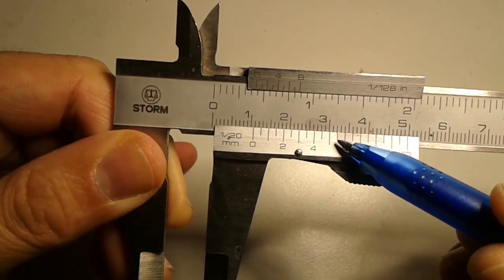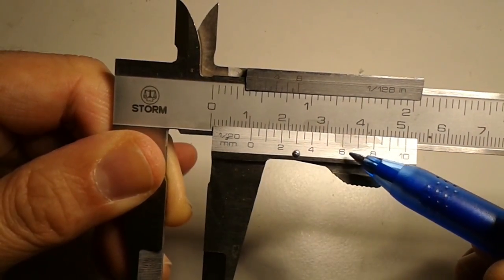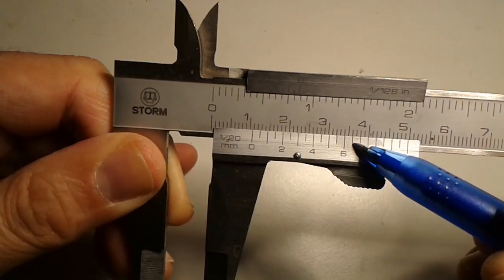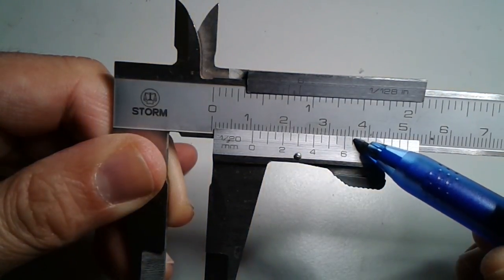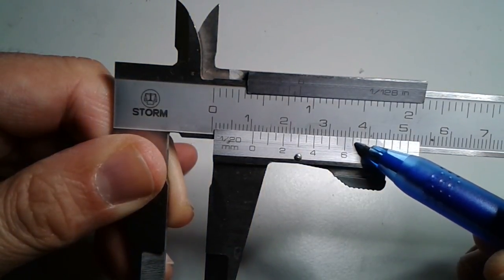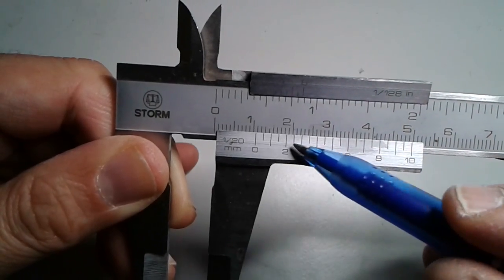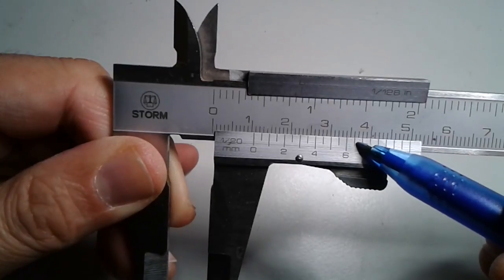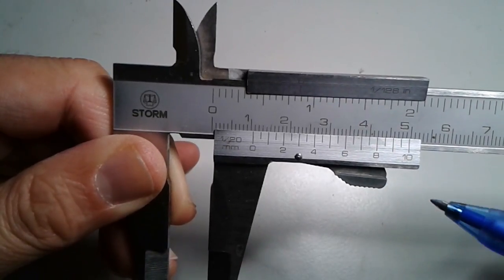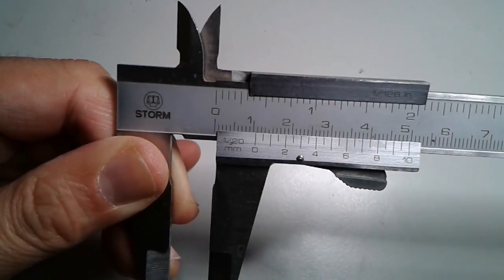Yeah, maybe 10.6 and 5, 10.65. So the diameter of the pen at this place was 10.65, so you can see that this caliper is even more precise but the concept is pretty much the same. Those calipers actually do also have a use in microscopy because what you can do is you can measure out the thickness of cover glasses.